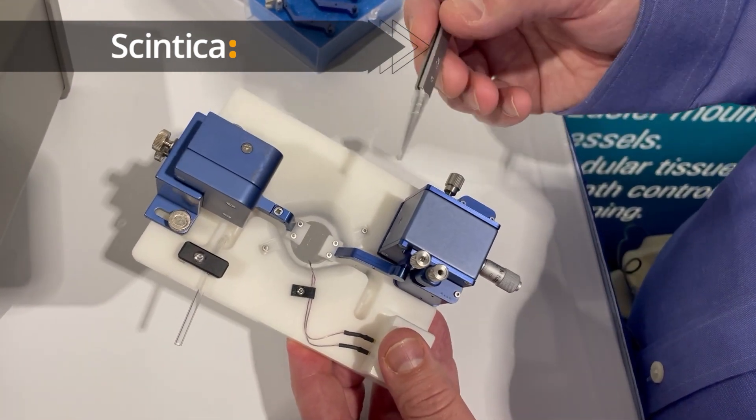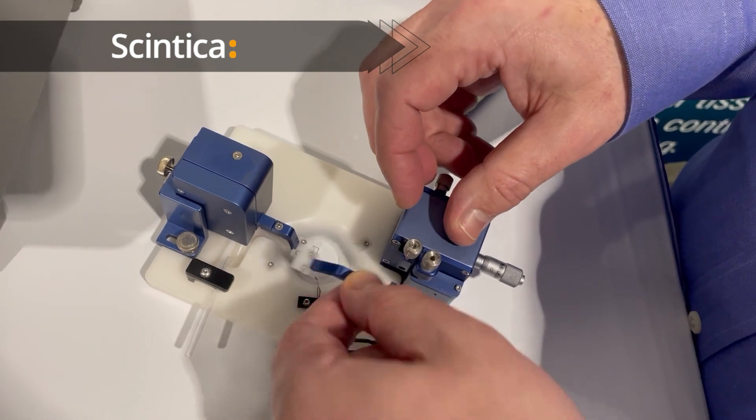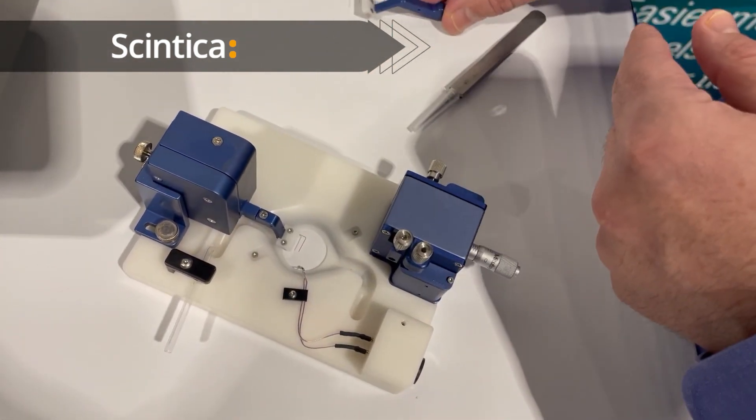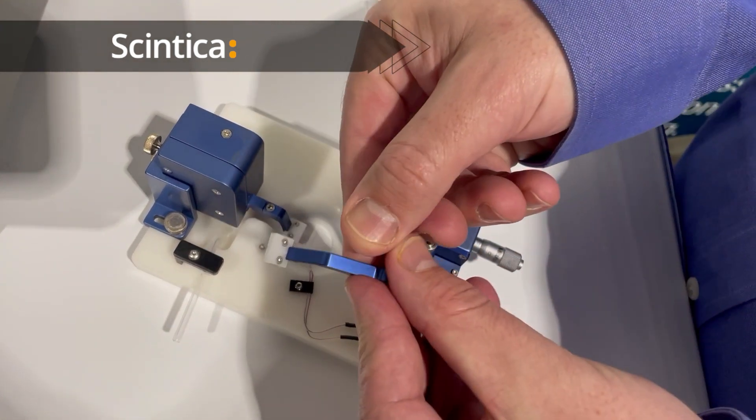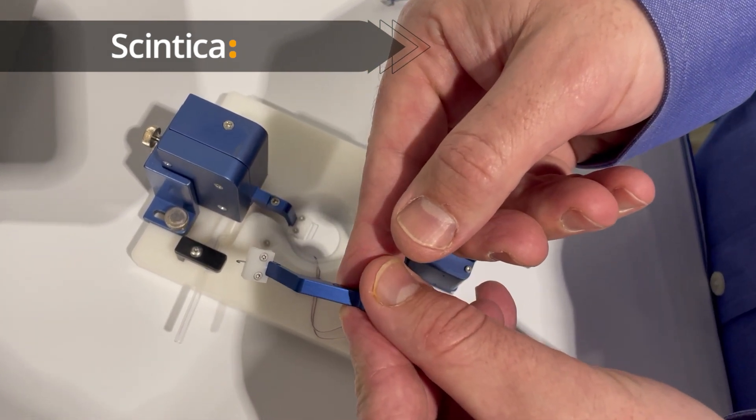The other side can be removed. And then the mounting arm can be replaced with either a hook style for studying ring or strips that are mounted with silk thread.